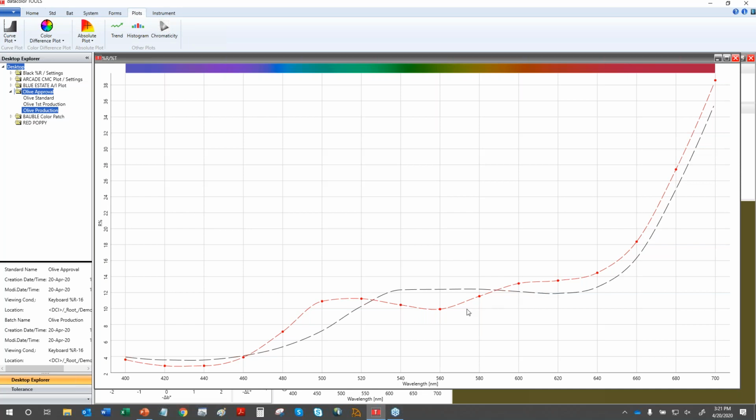So what I could confidently do is go back to my supplier and ask why they changed the dyes once they moved into regular production, even though they had an approval on their first production. So this is just one way that you might find the reflectance curve to be useful, is to determine whether or not those samples have the same dyes, and also whether or not something's fluorescent, because as we said, if the reflectance data goes above 100%, then we know we have a fluorescent sample.